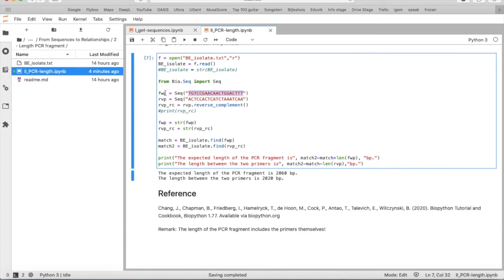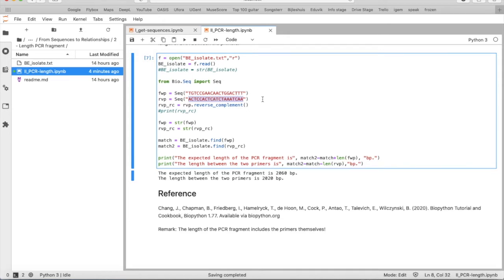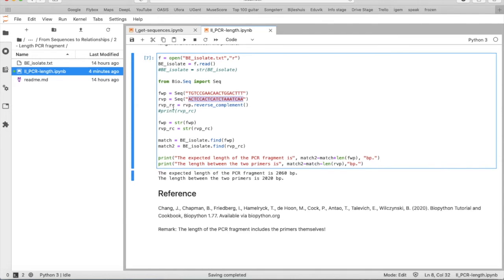So with the forward primer, we say it's Seq, and then it's sequence. Reverse primer is Seq, and the reverse primer sequence. But if you want to retrieve the reverse primer sequence in the BEIsolate file, we first have to use the reverse complement of this primer. And we can do this by using rvp.reverse_complement and save it as rvp underscore rc.